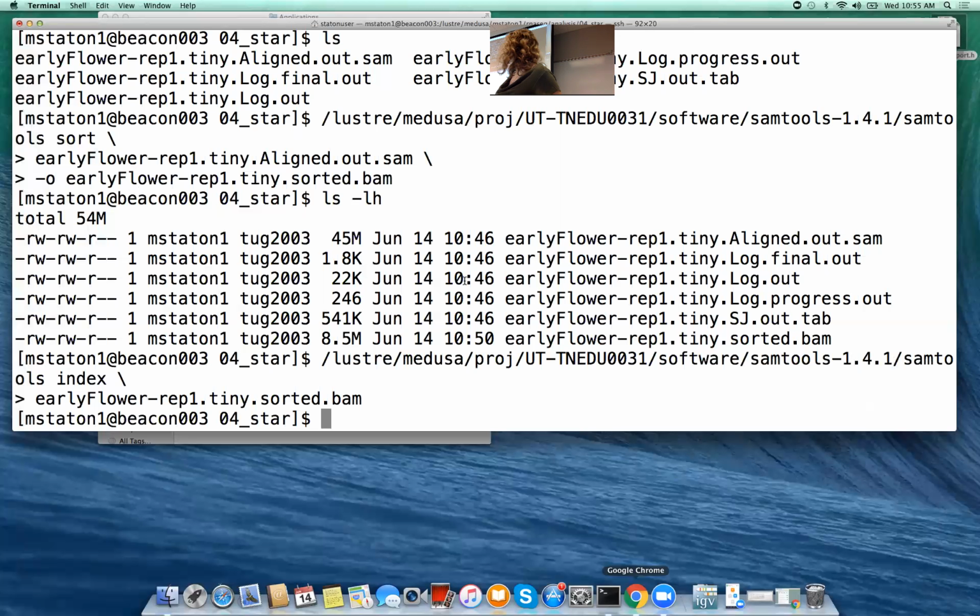Actually, you don't have to worry about this one, IGB will generate this .fai. Yes, so you need the other 4. The only one you don't need is the .fai. Ignore that one. IGB is going to create that for you on the fly. But try to transfer over the .fa, the .bam, the .bai, and the .gff3. And I think all 4 of those, the instructions are here.